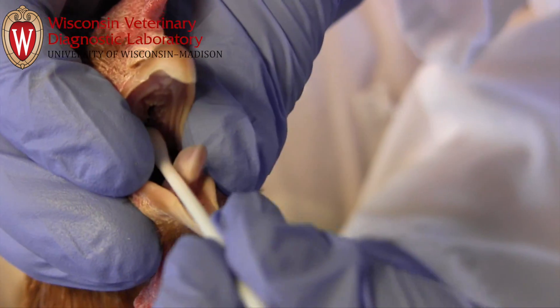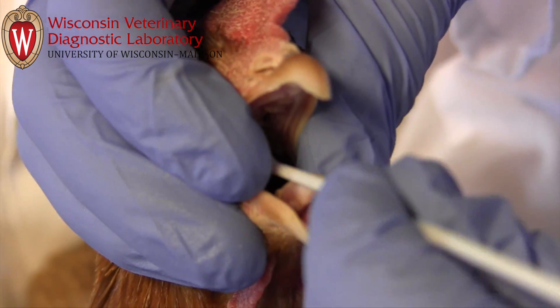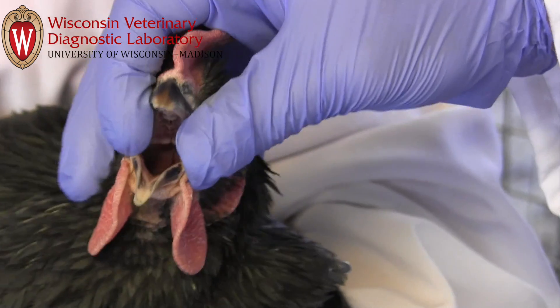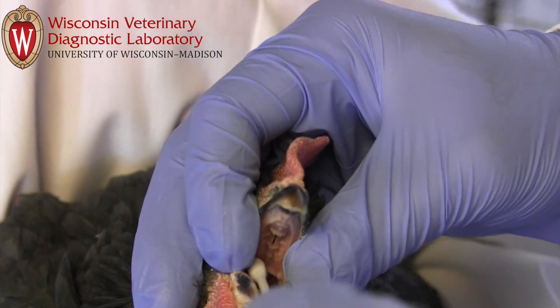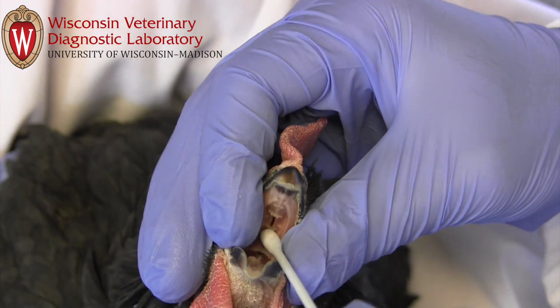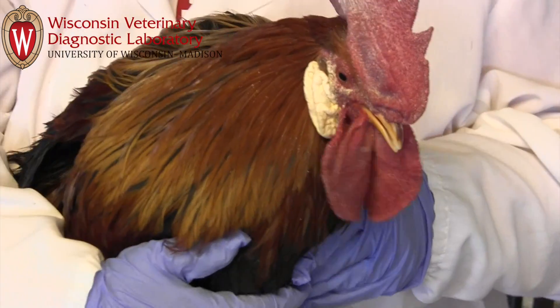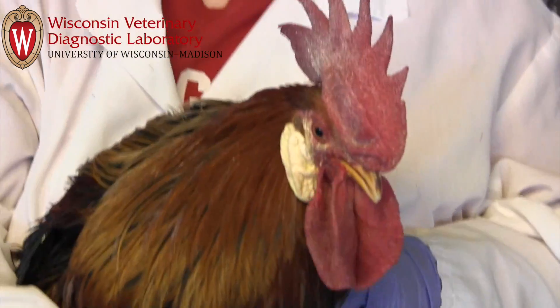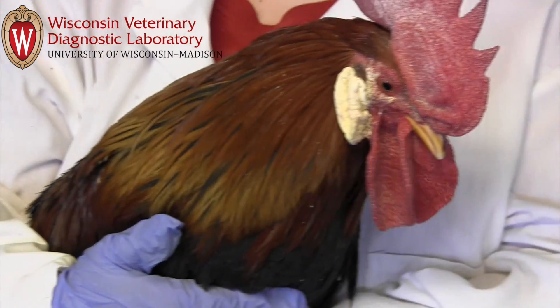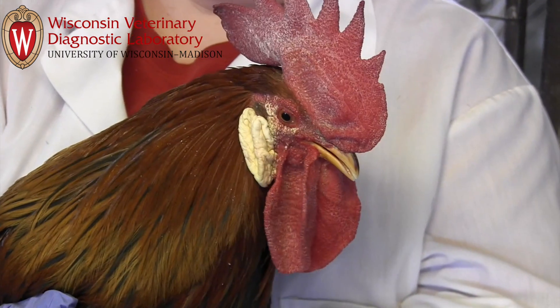Lightly swab the choanal slit and the surface of the oropharynx. The bird should not experience pain or significant discomfort. The swab may be visibly soiled, but may also appear to have no adhered material. This is acceptable as long as there was adequate contact with the mucosa. It is highly recommended to have at least one person to hold the bird and one person to swab and handle samples.